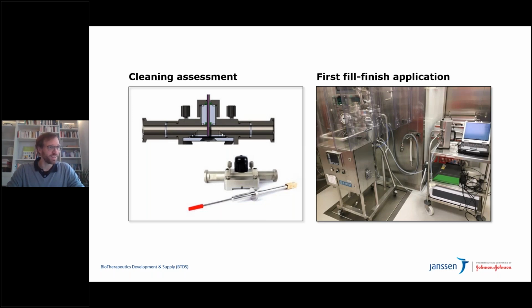Maybe some of you might find the card we are using a bit weird to look at. That was really some of the first build-ups we had. Now the cards are much more sophisticated, with a much smaller footprint. But back then, that was how the setup looked, and you can see all the connections, pump, and so forth that we had.